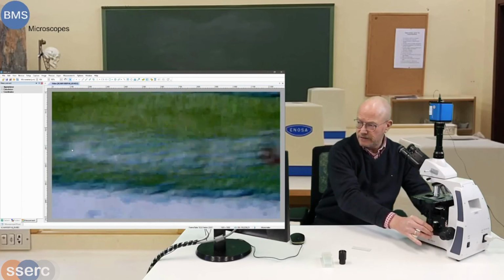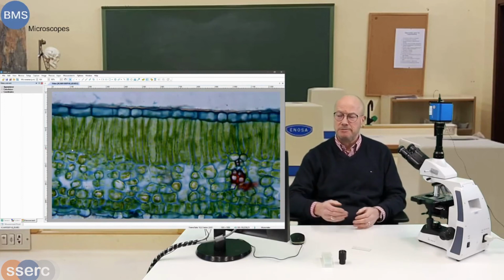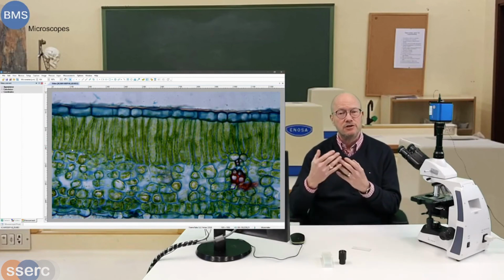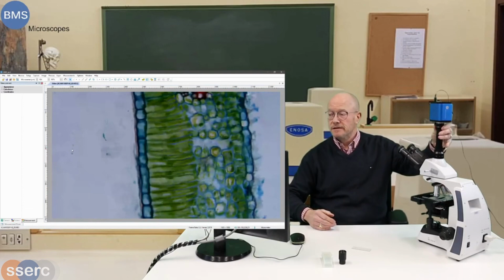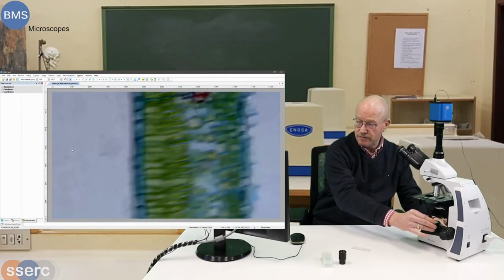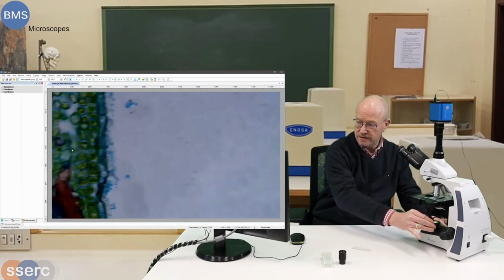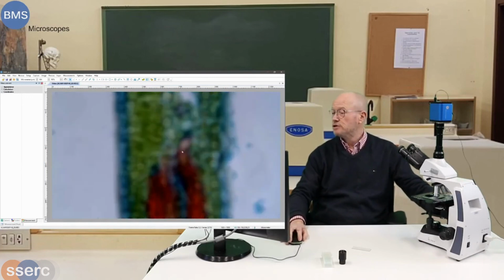Well, you can see that I got very little space on the top and on the bottom, and I don't want to do 2 measurements. Like for instance, I do 1 measurement here halfway, then I move my slide and do the second half, which gives me, of course, more reason to make mistakes. What we can do now is, for instance, completely rotate the image. You have to know for sure where we are. We can center this one. We have to go up a bit. And now we can see the place where we used to measure.